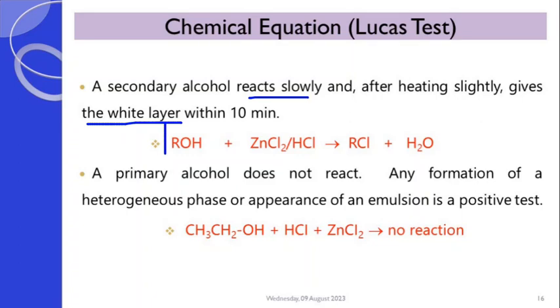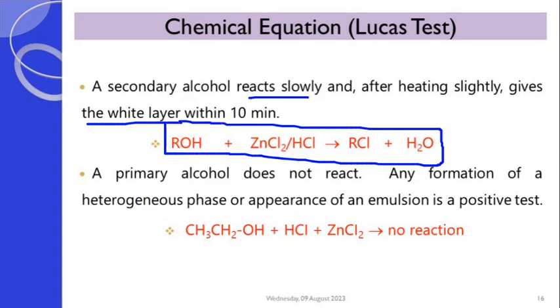This is the equation representing that for secondary alcohol test. Primary alcohol, however, does not react. In other words, there is likely going to be no reaction.